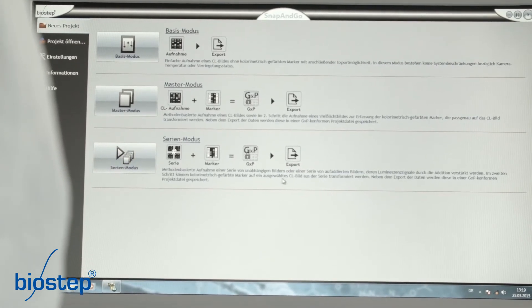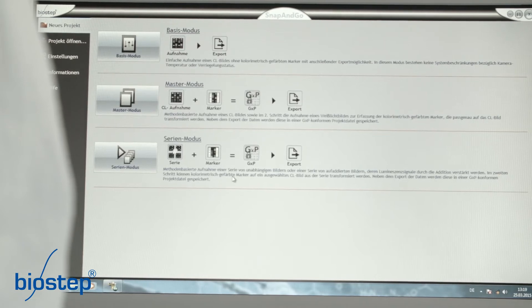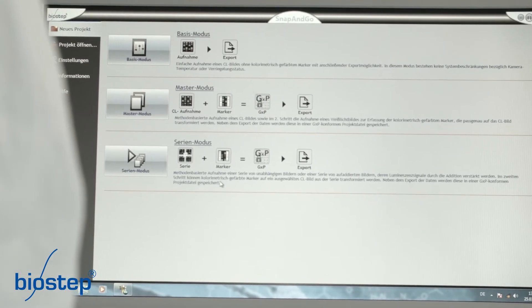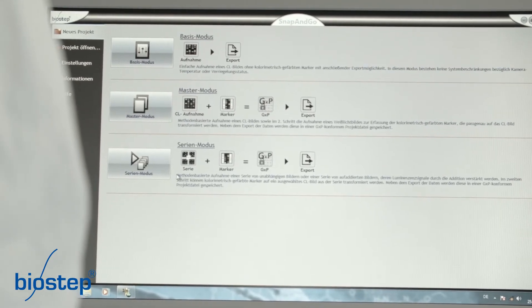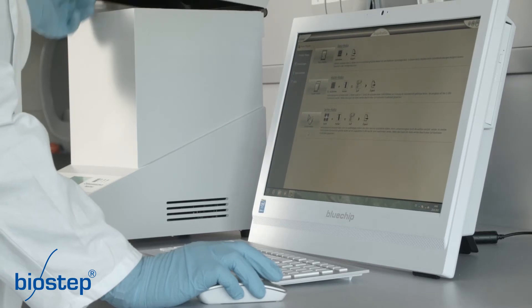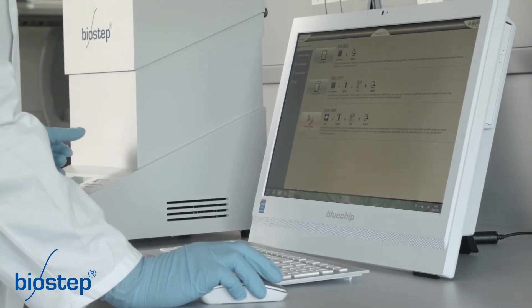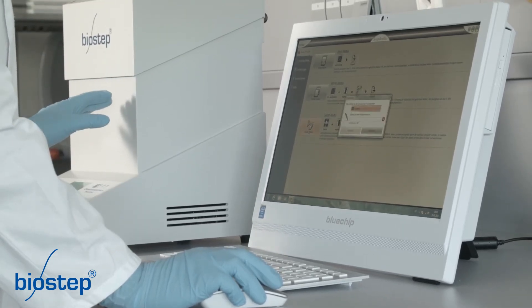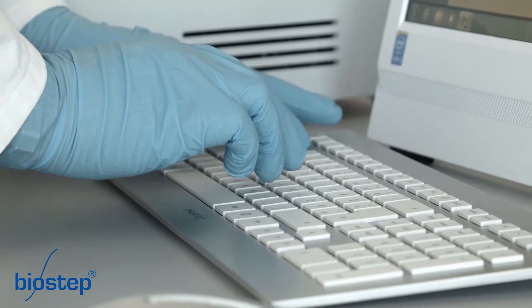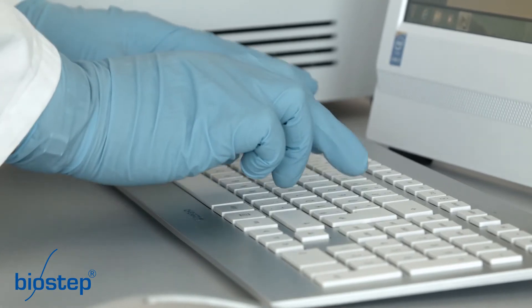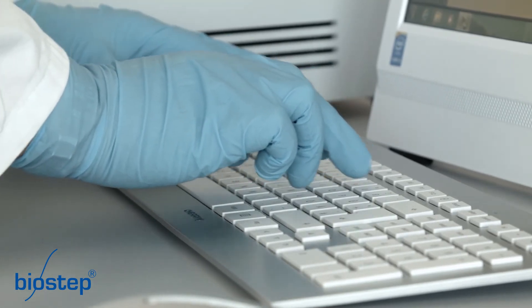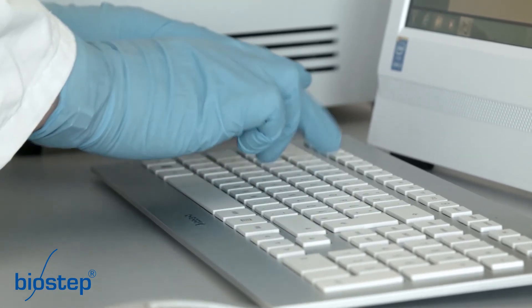This mode is GXP conform. The serial mode acquires a series of images according to your settings and integrates colorimetrically stained markers. This mode is GXP conform too. You can see the serial mode here.